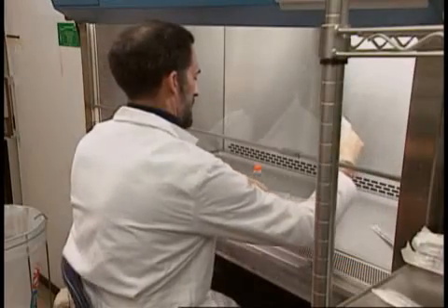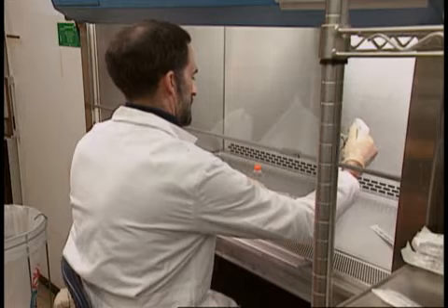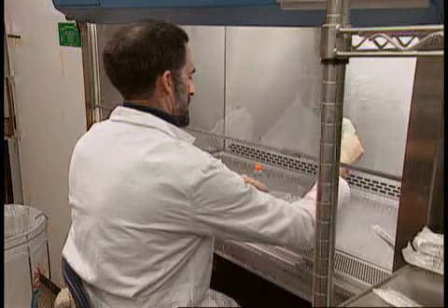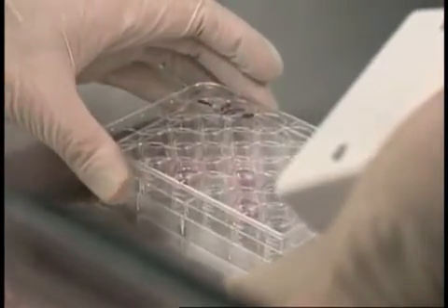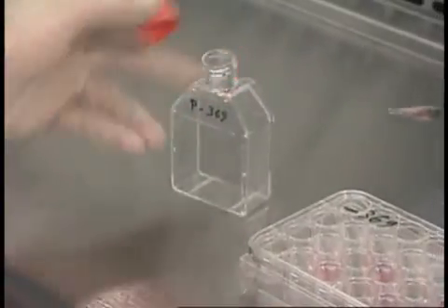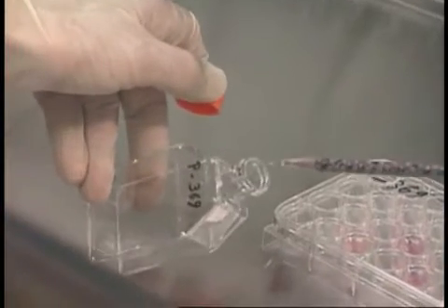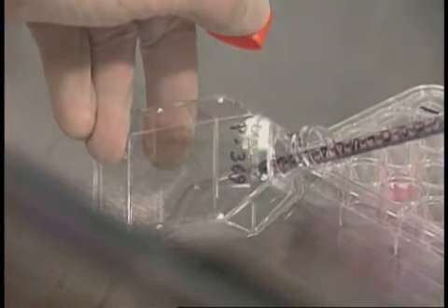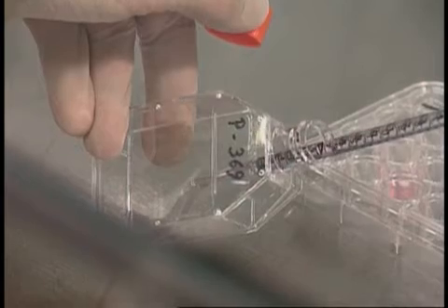Mohammed protects himself by wearing a lab coat and gloves. The cabinet's sash provides eye protection. The pipettes he uses are aerosol proof, and he avoids splashes by discharging the pipette against the flask wall.